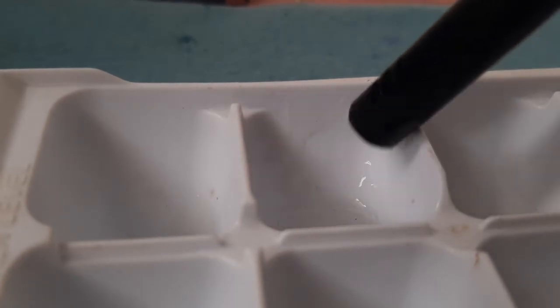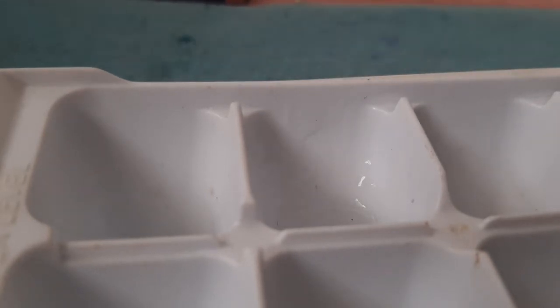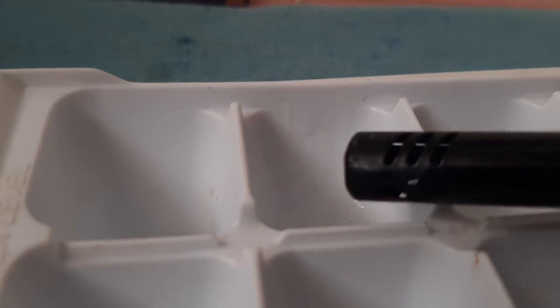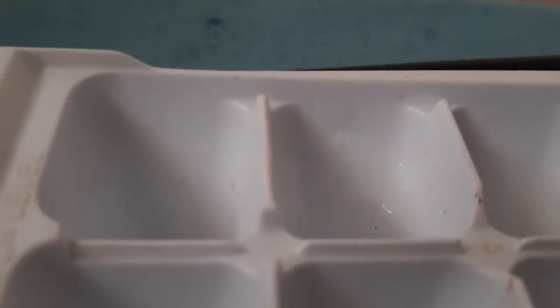Okay, it started burning, I think. Okay, it's not burning. That means, okay, it's burning. So over here I'm just going to release the gas, and you can see a slight flame. Oh, that's glowing, burning up. And as it is burning, you will see that the temperature is going down. So please do not try this at home. Okay, you can also do it with your parents, but not at home. So I'm going to just turn it off. Okay, the flame's gone.